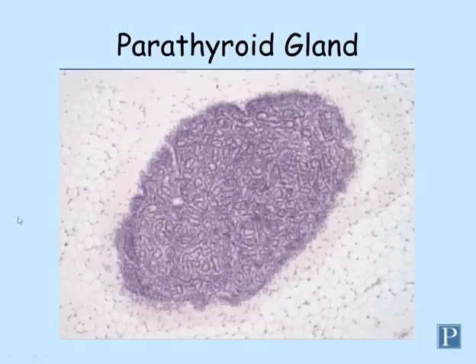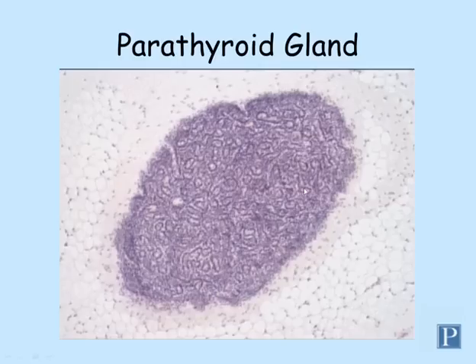Here is a higher magnification view of the parathyroid gland. Observe the presence of the basophilic cords of cells. You don't need to be able to distinguish between specific types of cells in the parathyroid gland — we're not going to go into that much detail.